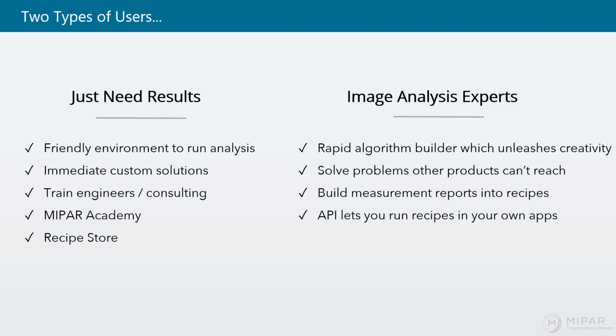As you've seen, the measurements that you add to the recipe are immediately generated upon execution, and that allows your experts to configure the entire workflow to be run with a single drag and drop by perhaps less experienced operators. And lastly, I'll mention that we do offer an API that allows your apps to execute MIPAR recipes with a single line of code if you are looking for that level of integration.